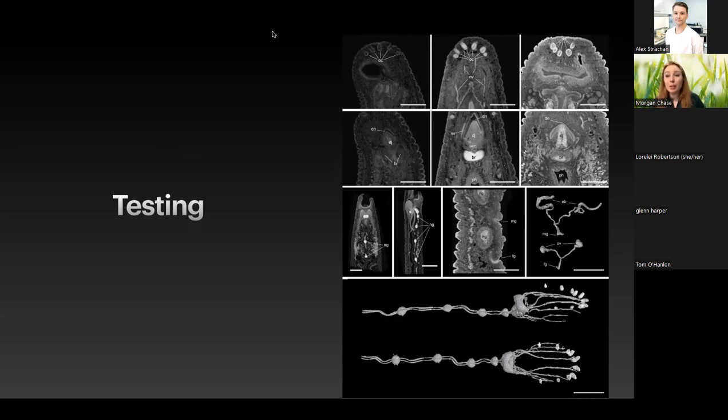And so not only with the osmium could we identify visually, but we could also segment them out. So in software, we could visualize the whole neural anatomy, so you'll see the neurons passing along the anatomy all the way to the end where they're pointing to the eyes. I think they're called eye spots. So that was sort of unbelievable.